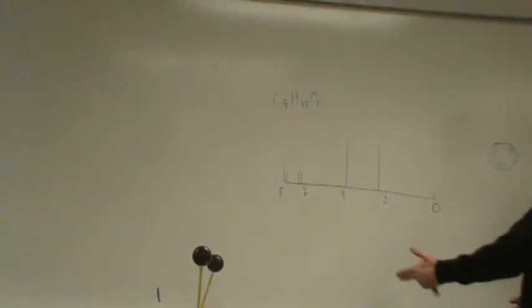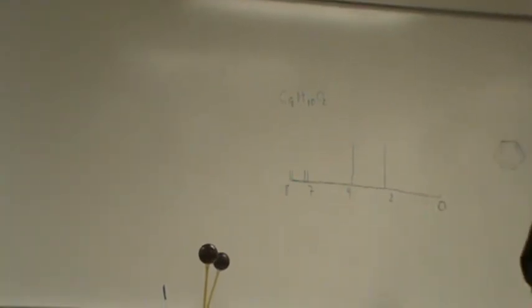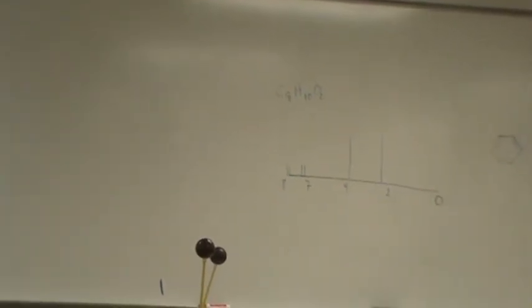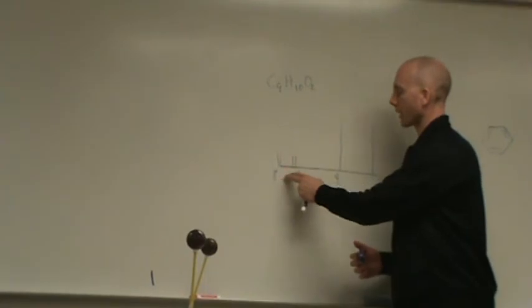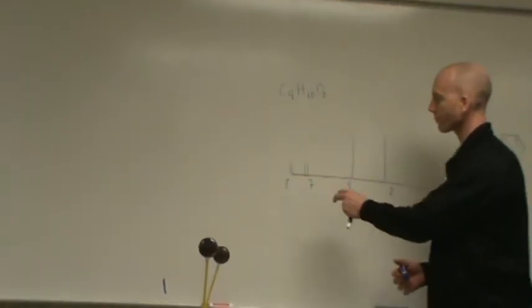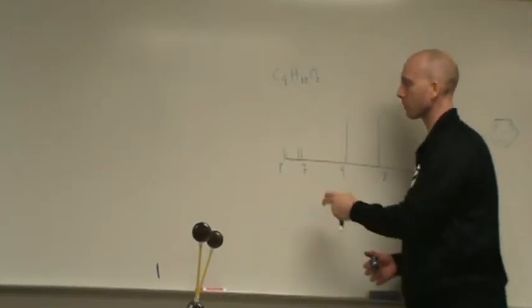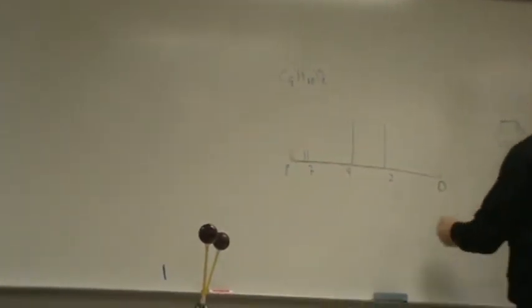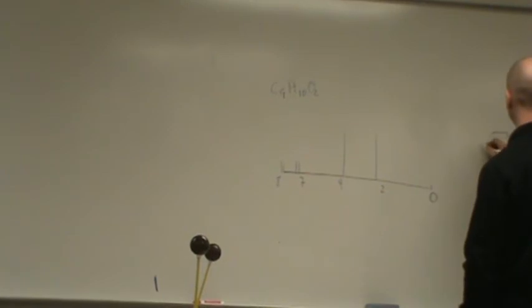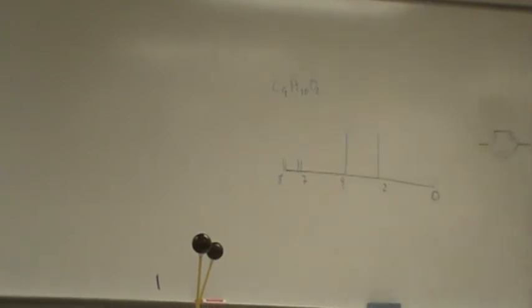All right, so that's the first thing I can draw. See that IR, couldn't really tell that. NMR, oh, we got it. Okay, the next thing, I'm going to give you some help here. So anytime you see 2 doublets between 7 and 8, that tells you, write it down, that I have para substitution.